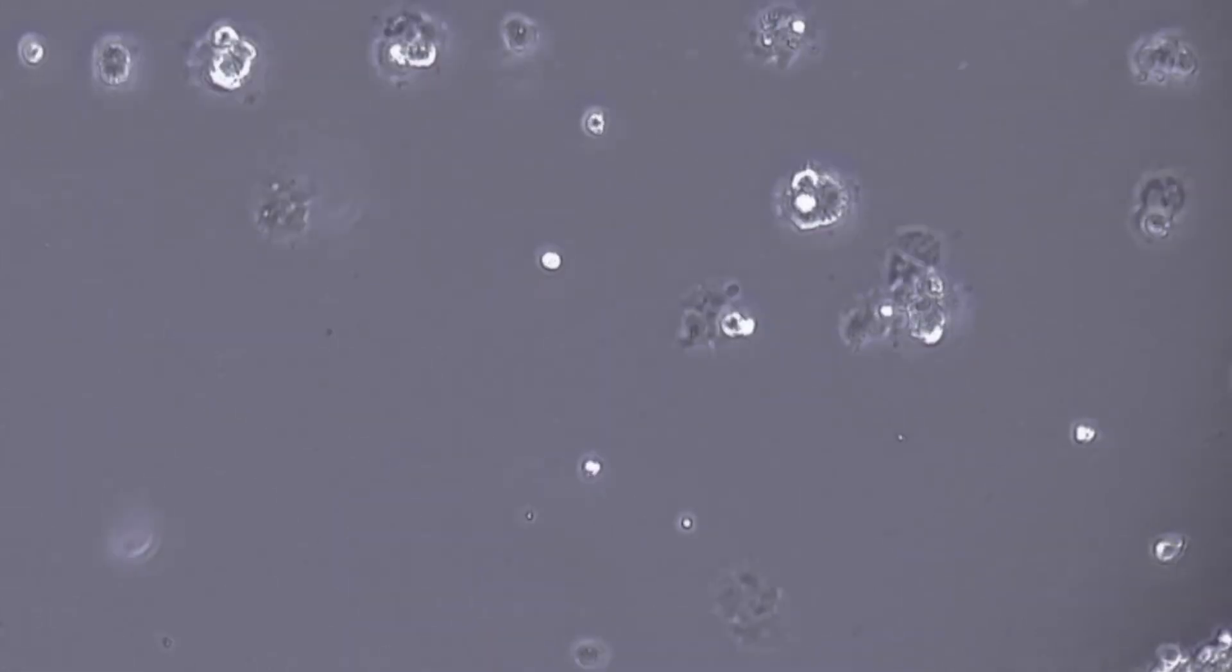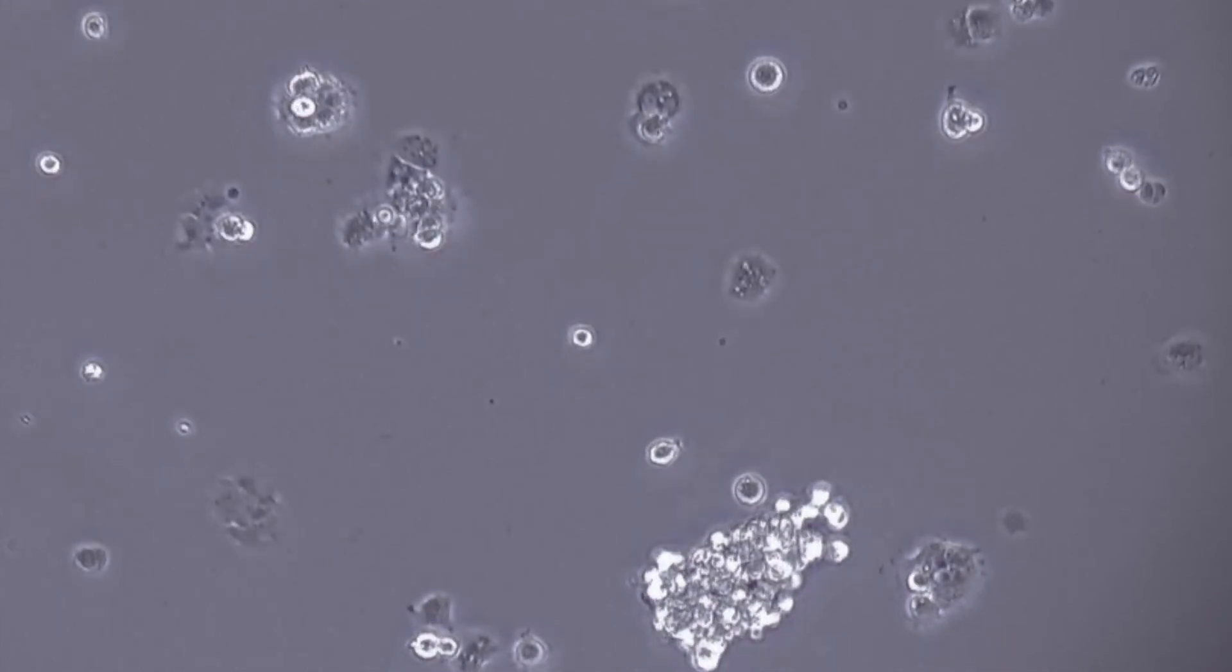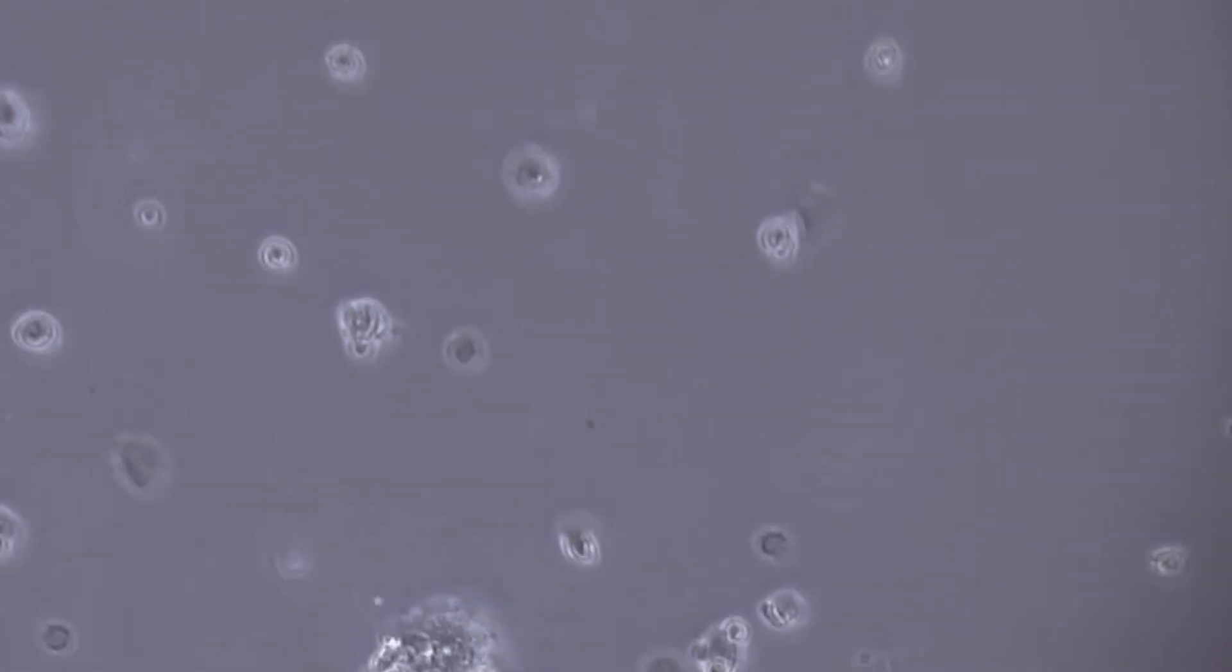After checking the cells, carefully transfer the dish to a 37 degrees Celsius incubator with 5% of CO2 and leave the cells undisturbed for about 24 hours.